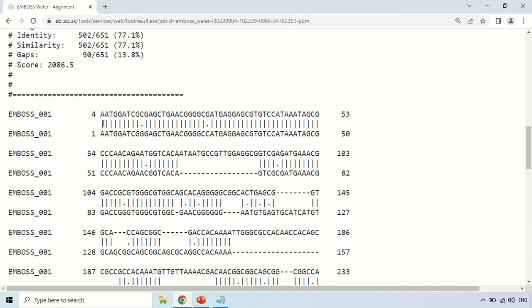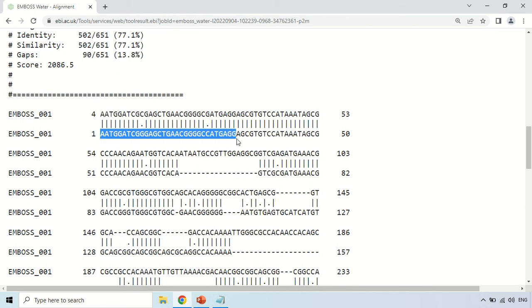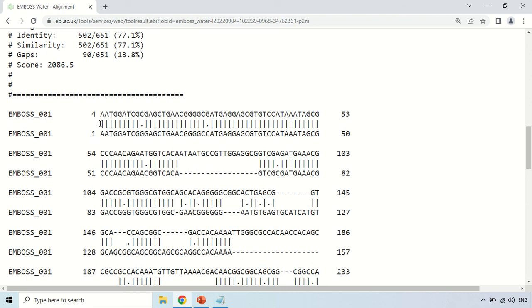Here you can see the first sequence and the second sequence aligned together. The vertical lines represent the same nucleotide present in both sequences — meaning they are matched. For example, here you can see 'A' in the first sequence and 'A' in the second sequence, so there is a vertical line. The vertical line shows similar bases in both sequences.